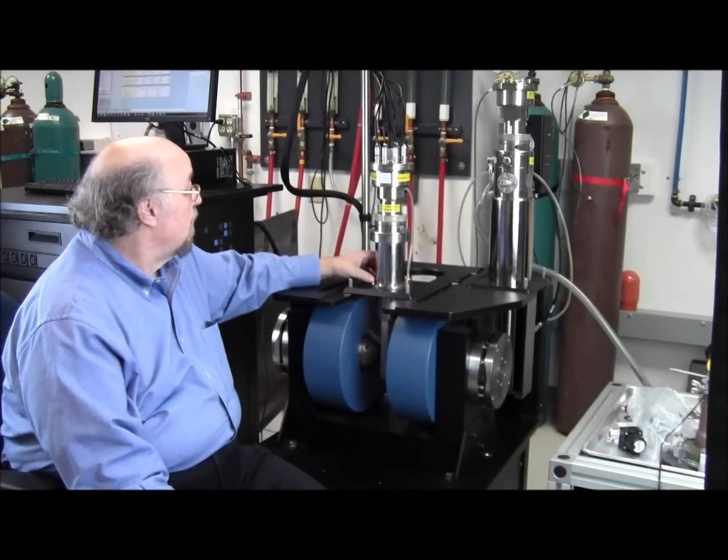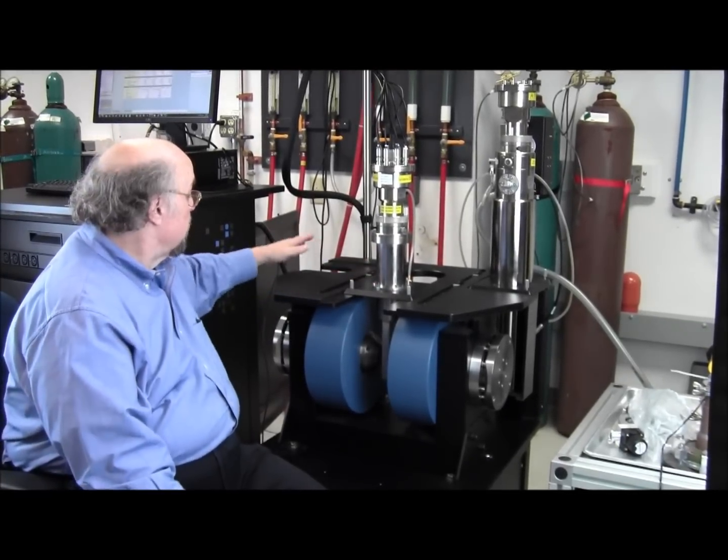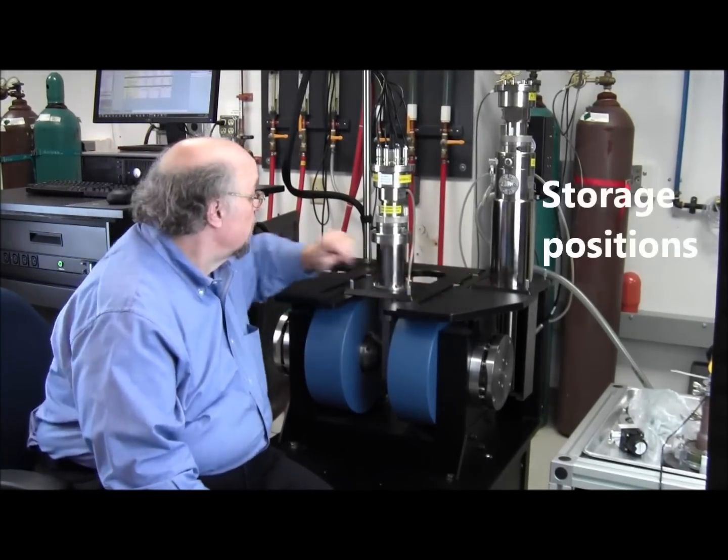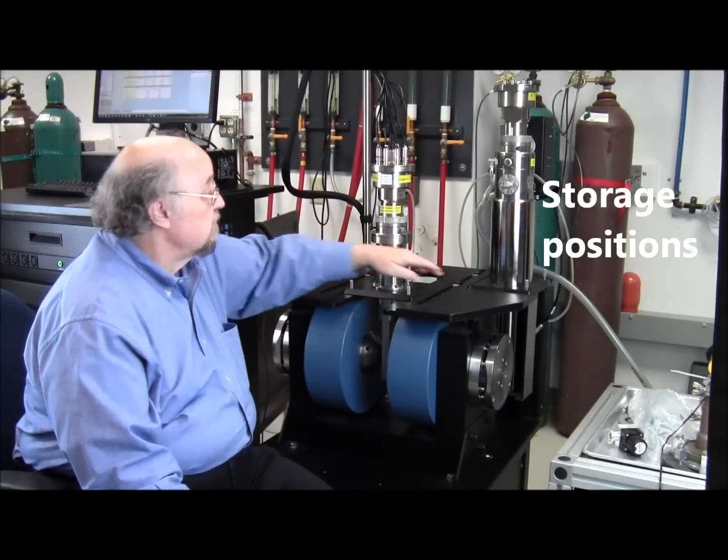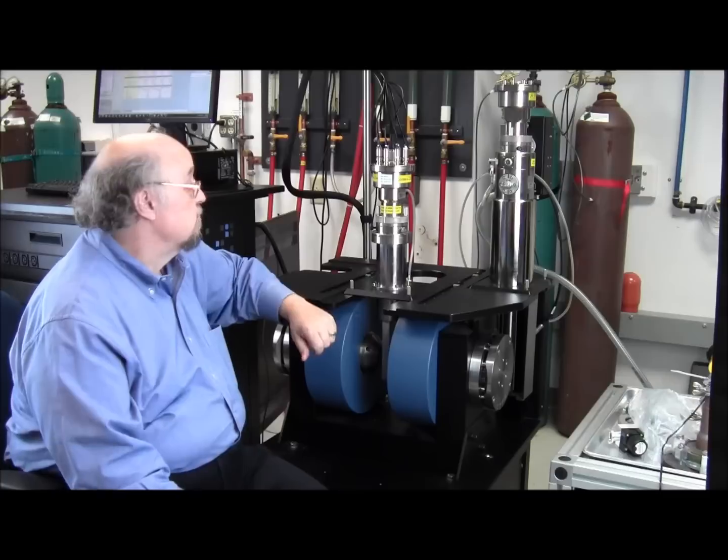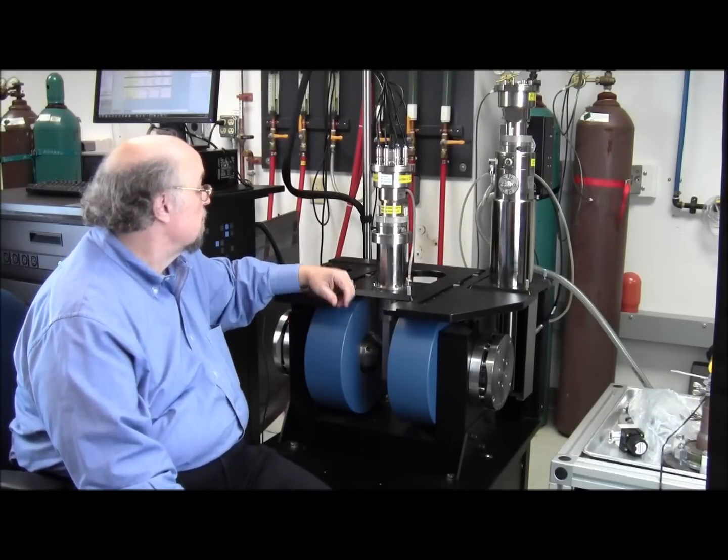There are, of course, optional sample modules available on the system, and there are positions here on the side, in the back here, for storing those systems when they're not in use. Here, in fact, is an oven that's being stored over here because we're not using it.